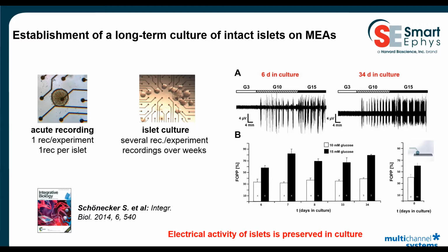And even more important, we could directly compare the recordings from cultured islets with the acute recordings we did before. So the take-home message here is electrical activity of islets is preserved in culture over a very long time on top of microelectrode arrays. The data are also published in our second MEA publication.